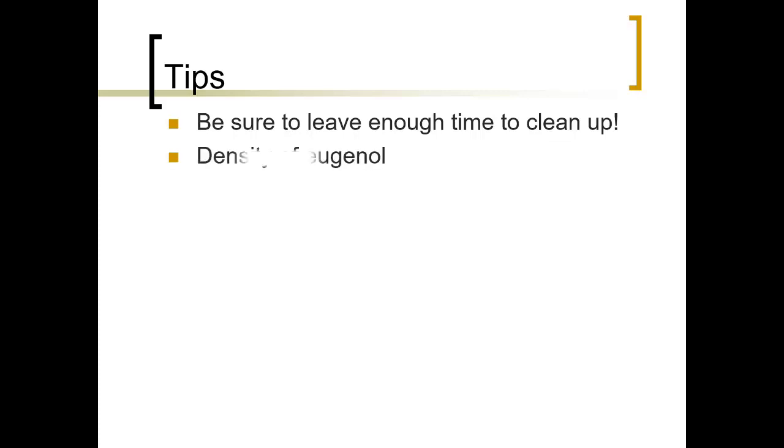Now, be sure that before you leave, you have time to clean up. The thing with the distillation is it's going to be hot, so you're probably going to need to give yourself 10, 15 minutes before the end of lab to make sure that you've had enough time for your distillate to cool.